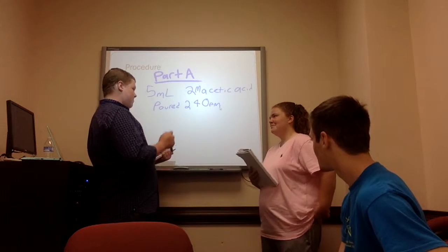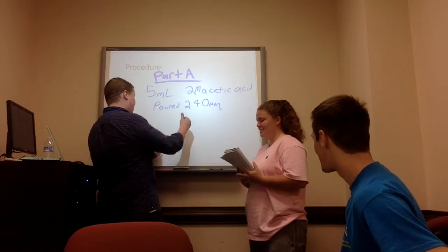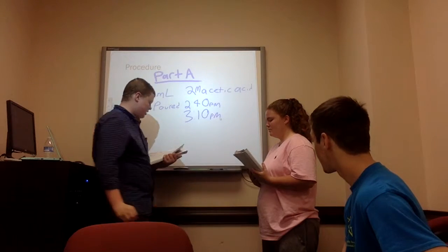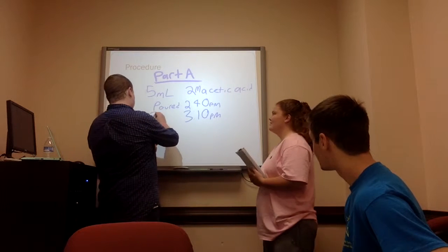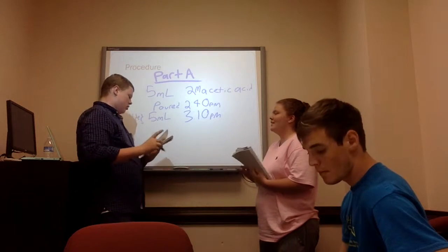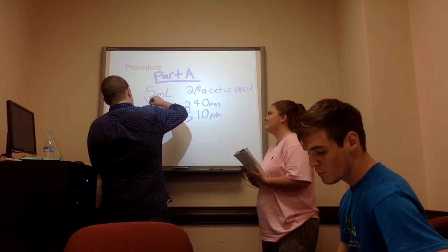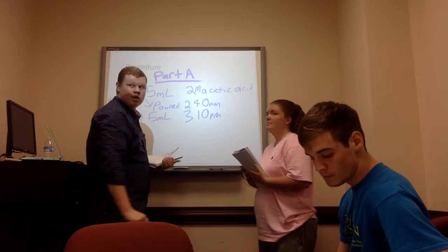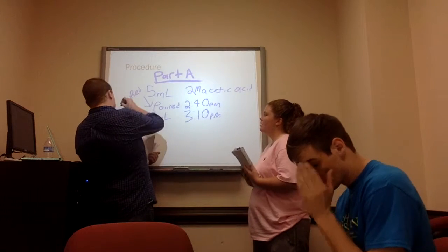So, you all waited 30 minutes, and at 3:10 p.m., what did you all do? Could you please tell me? You added how many more milliliters? 5 more milliliters. And when we started, it was a reddish color after that. Okay, we can add that. So good observations. That's good skills right there. Red at that time. Do you remember what color it was at this time? It was the same color, it was just more diluted.